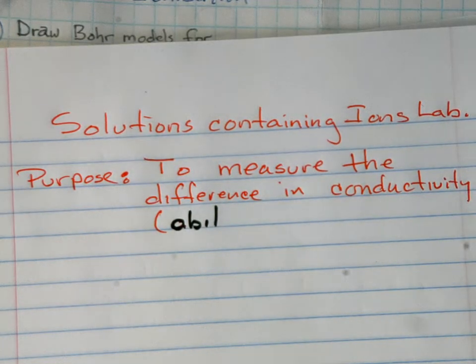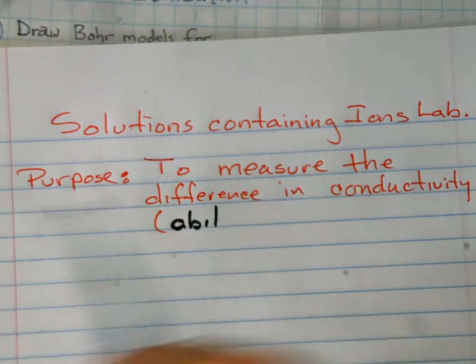All right, for my students that are gone, this is a lab we're going to be doing in class. Bummer, you missed it. We're in chemistry doing a chemistry lab. So get this set up. It's called solutions containing ions.